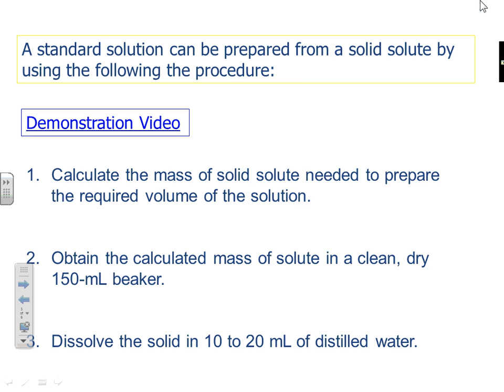Now, in the lab on Google Classroom, I've attached the video. So as you're doing the lab itself, if you forget a step, you could actually just watch the other person do it and do it the same way. All right, so you could observe the proper technique as you're making the solution. And I guess I shouldn't call it a lab because it really isn't a lab. We're not discovering anything. We're just making a solution.